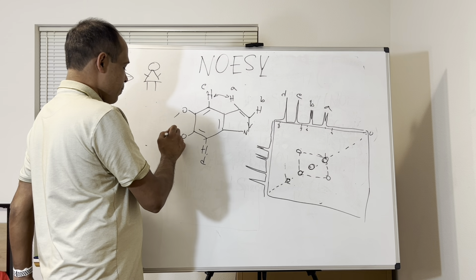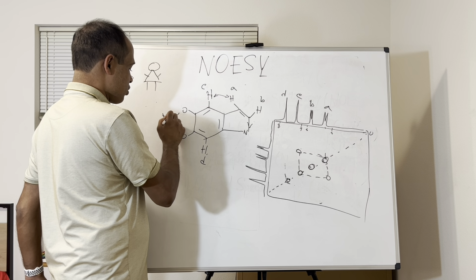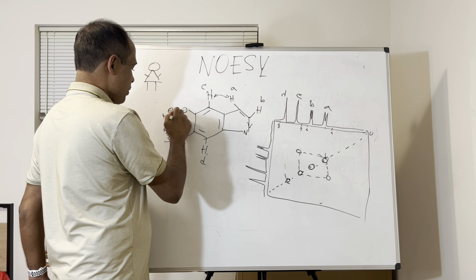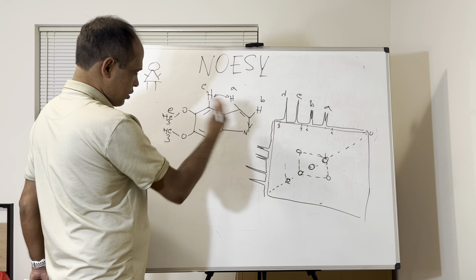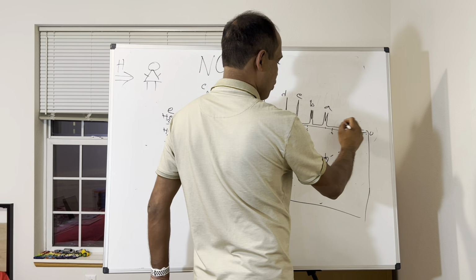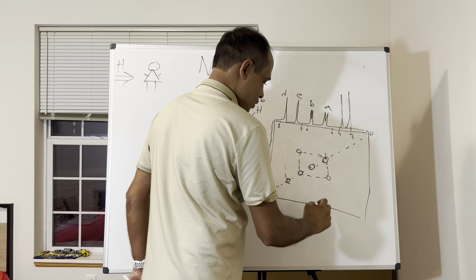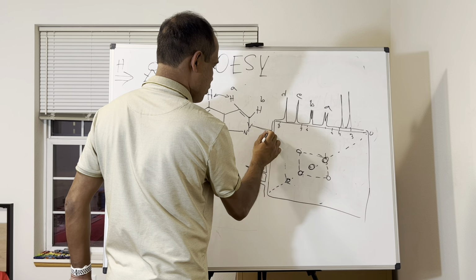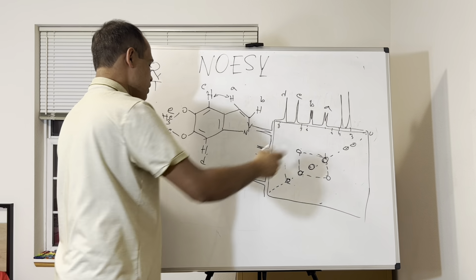There is also a proton like methoxy, right? So 2-methoxy, so it will be like A, B, C, D, then E, and they are kind of symmetric, not symmetric actually, so E and F. You will see two singlets near 3 to 4, two singlets for the methoxy, and you will definitely see the diagonal peak, and you will not see any cross peak.